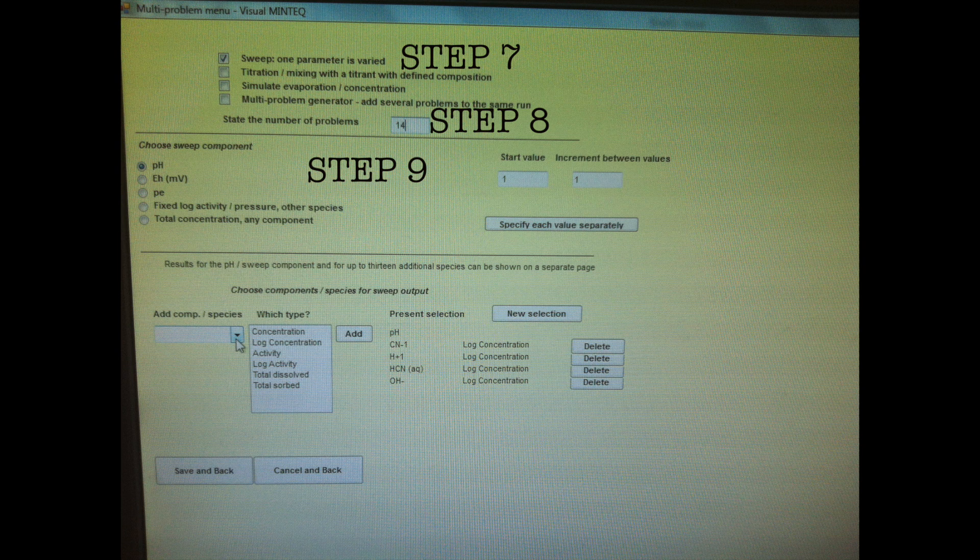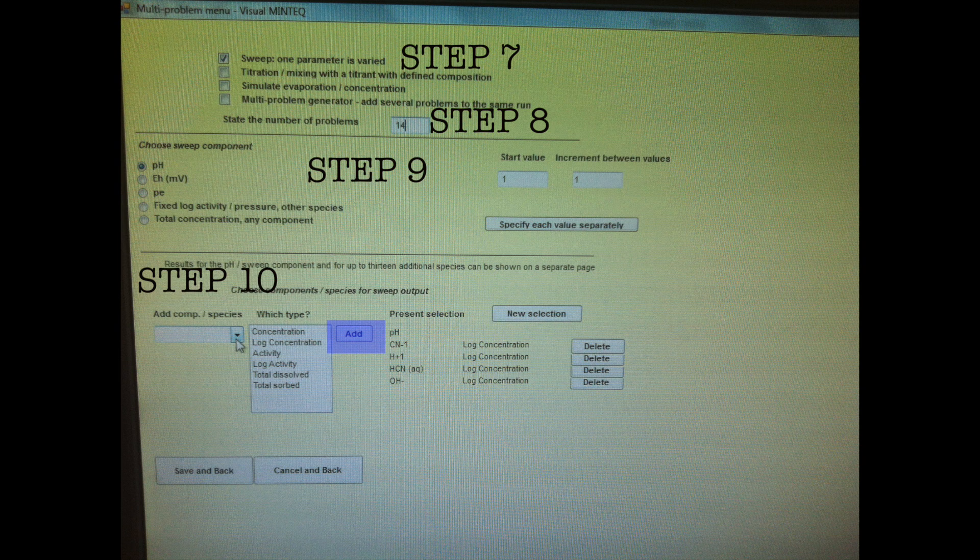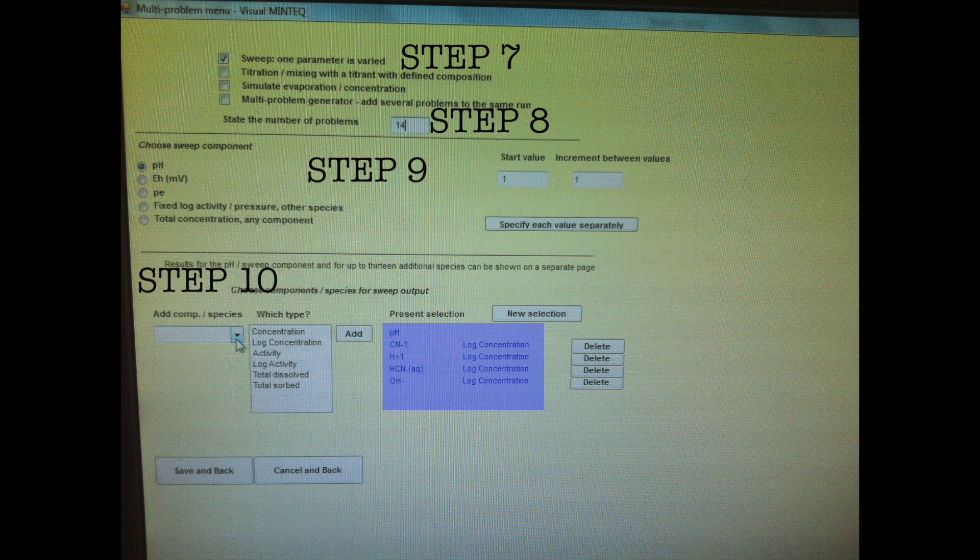Now we need to say what we want in our output, so we'll go and select our components or species. We go ahead and select log concentration. We add each species and component - they should all show up, everything that we're interested in. Let's save this and go back to the main menu.